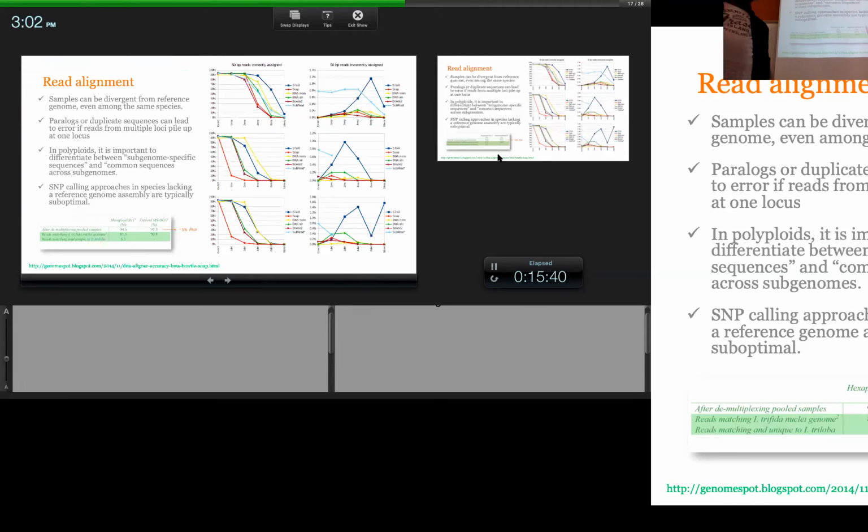They all do perform a little bit differently. But typically, what most people use is the BWA-MEM because, as you can see, it does a better job. If you look to the top left, you're looking at cases where you're trying to recover a SNP. You do see that the STAR aligner performs better. The BWA-MEM is in yellow.